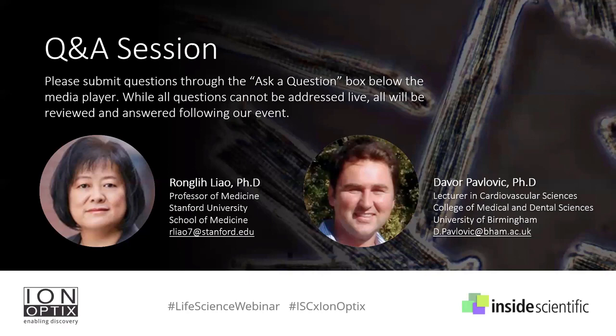And then you just follow what you need to do and don't even think about the time to hang the heart. You will be surprised, a few hearts later, it's really hard not to hang the heart within a few seconds. So I think time is of the essence. You want the time to be as short as possible, but at the same time, you also don't want to put that pressure on yourself, because the more you think, I need to get that done in 3 seconds, the more you're probably going to take 10 minutes fiddling around the heart and not even get it onto the cannula.